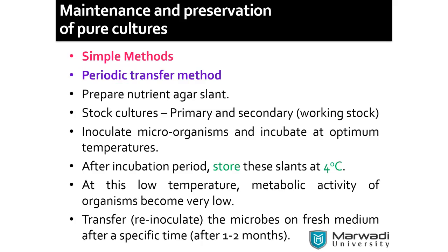They periodically come, maybe every 2 months or 6 months, to check whether it is working properly or not. Calibration is required. Otherwise, we may think that okay, temperature is going on, but the real temperature is not there. There may be some technical errors.